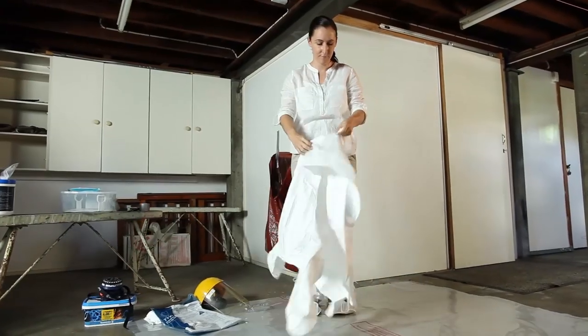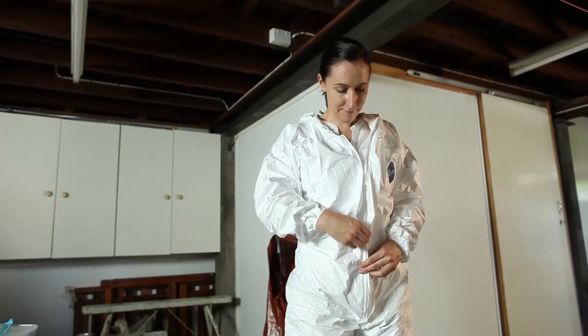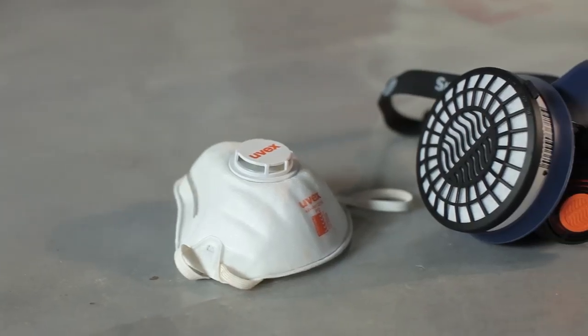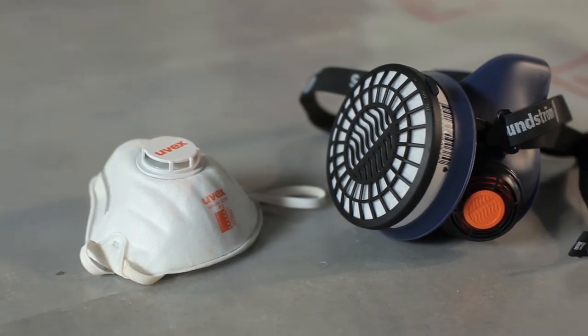When putting on your disposable coveralls, be careful not to tear the fabric and ensure the zip is pulled up to prevent dust getting into the openings. Disposable and reusable respirators are fitted with filters to protect you from inhaling dust, vapours and fibres. The respirator and filters that you use should be rated and suitable for the kinds of hazards present. You can use a disposable or reusable respirator.